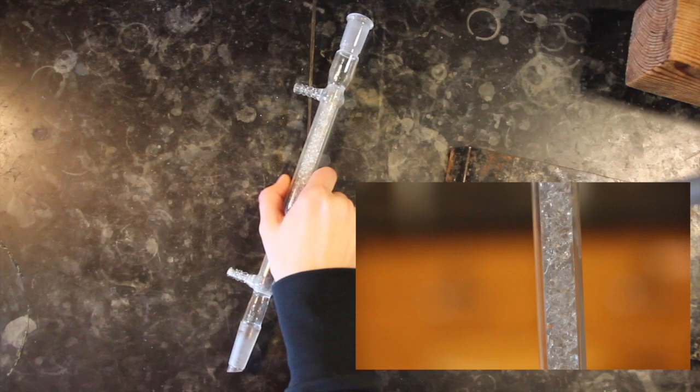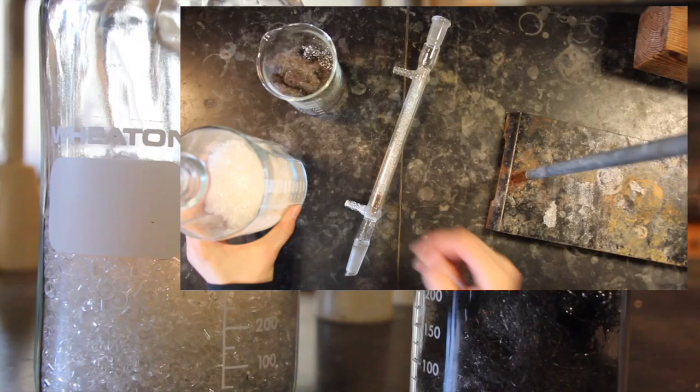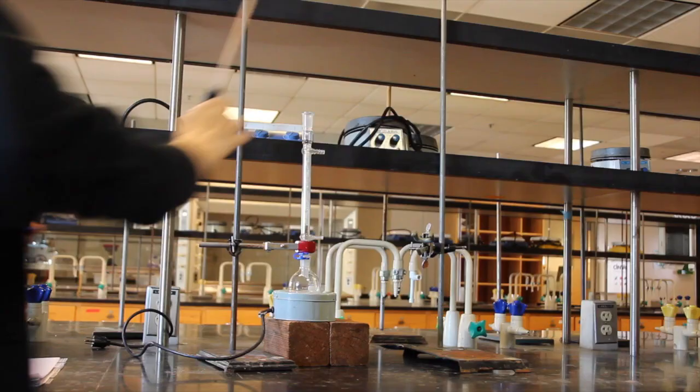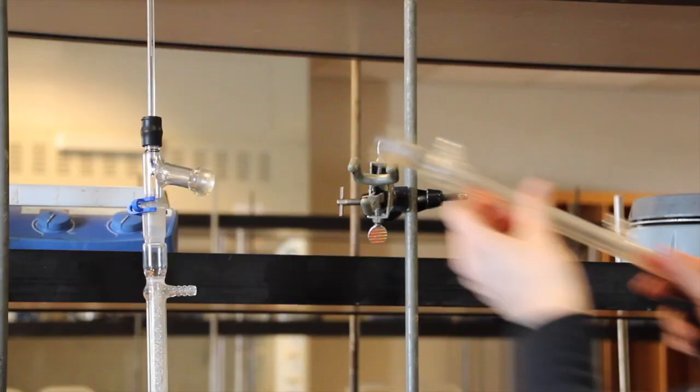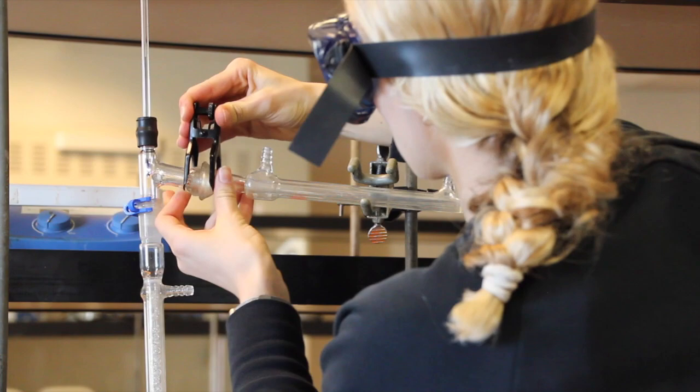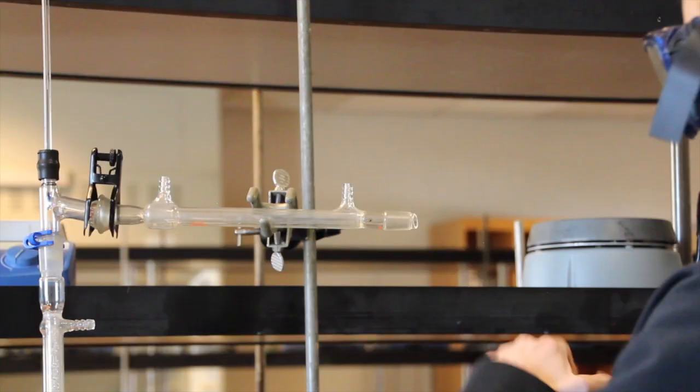Those setting up a fractional distillation apparatus should use glass helices to pack the fractioning column. To do so, gently place a small piece of steel sponge at the bottom of the column and then fill the column with these helices. When assembling your apparatus, use an additional clamp to securely support the fractioning column and the distillation head. This clamp should be placed near the top third of the fractioning column.